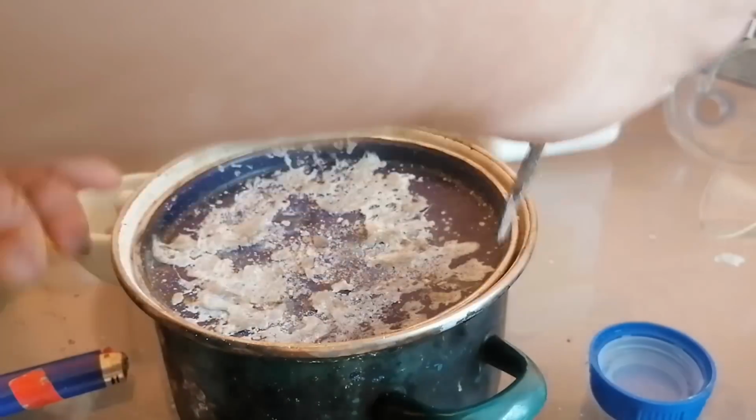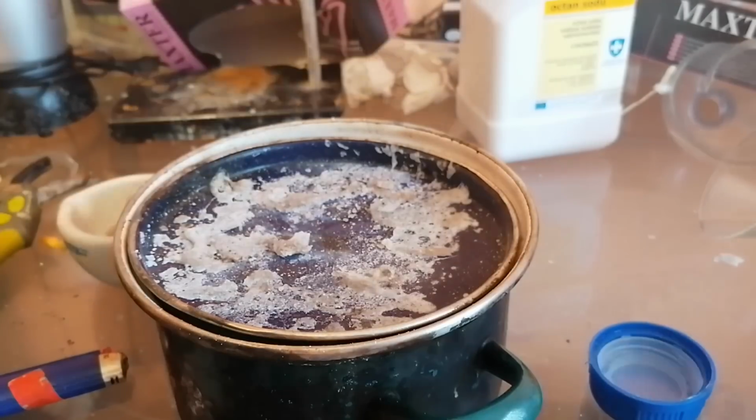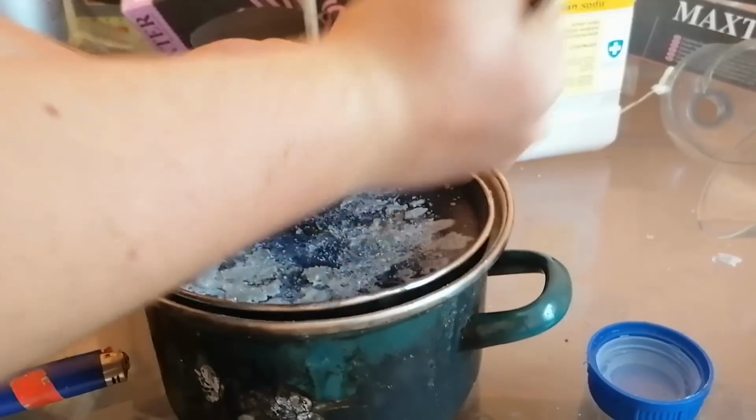Anyway, I've started chipping off the boron trioxide fragments from the pan, and even some of the paint stuck onto it. The boron oxide basically turned into an extremely hard crystalline mass, which kind of resembles very badly molded glass.